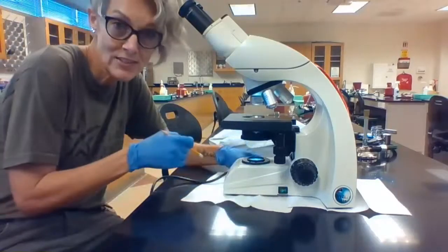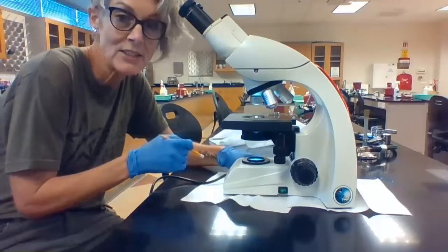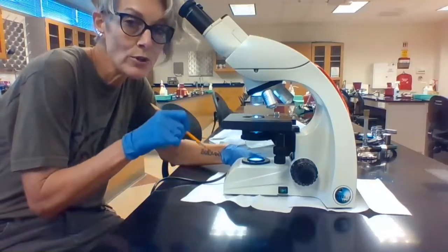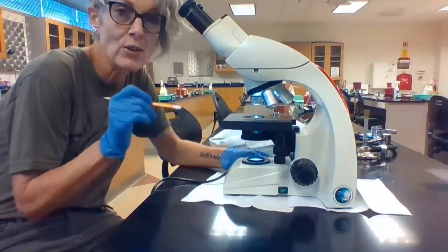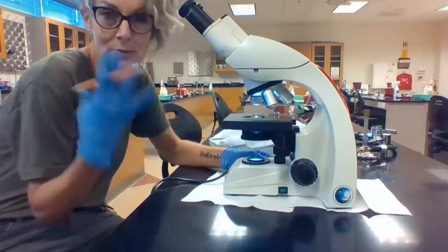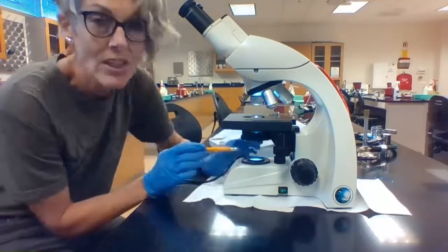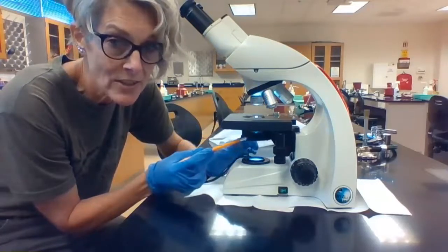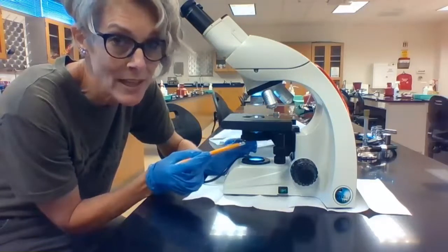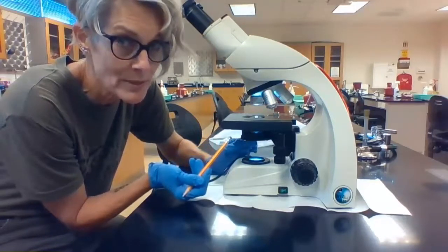Over here on the left side, there is a light adjustment dial. You can increase the intensity of light or you can dim the light. Your goal is you want enough light to see your specimen, but you don't want so much light that it's blinding and it's going to give you a headache. This next part is the condenser. The condenser is going to focus and tighten that beam of light before it goes through our specimen.